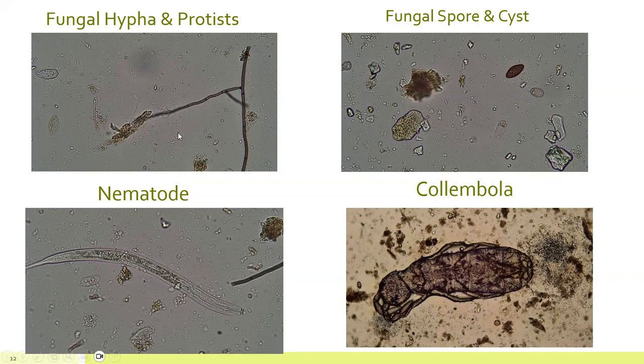And in all of these, you will also see bacteria. And this is something interesting, right? When we're looking at the microscope, you're looking at a lot of layers of water. So even though you're putting one single drop there, you're seeing a lot of layers.